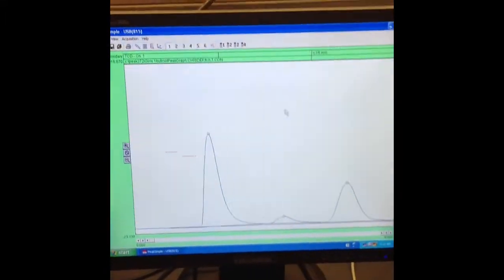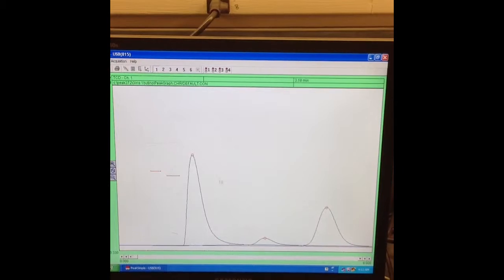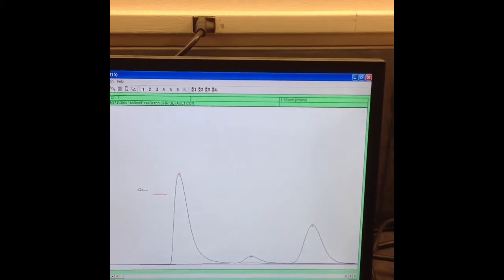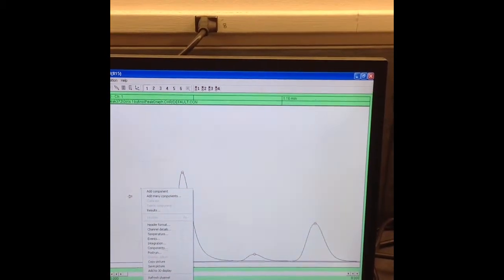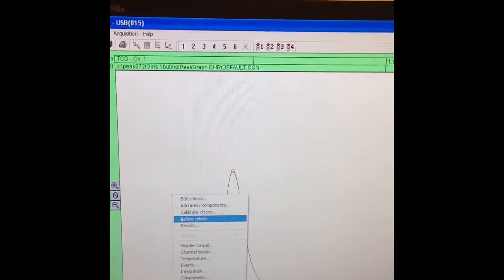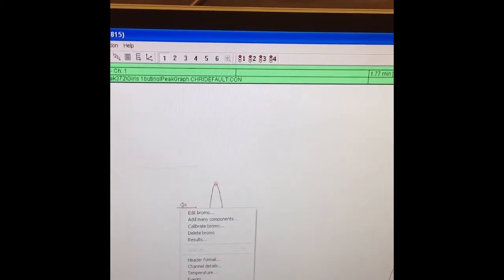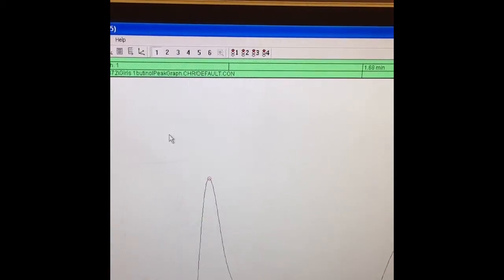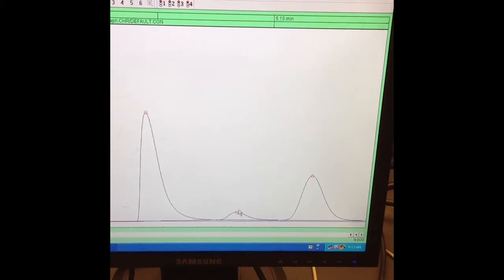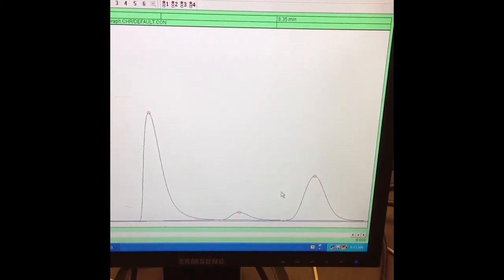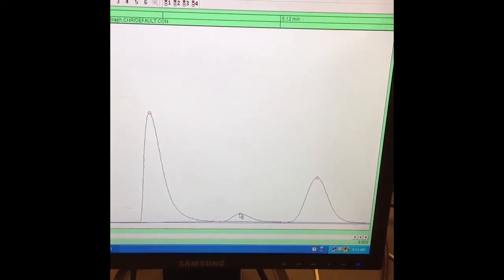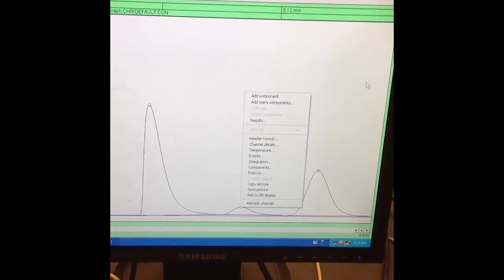Here we have our peaks, and this is our pentane here. And we'll just kind of ignore it because it's a solvent. So first thing I'm going to do is actually get rid of these red bars. And if I actually right click, then I can delete this one as well.